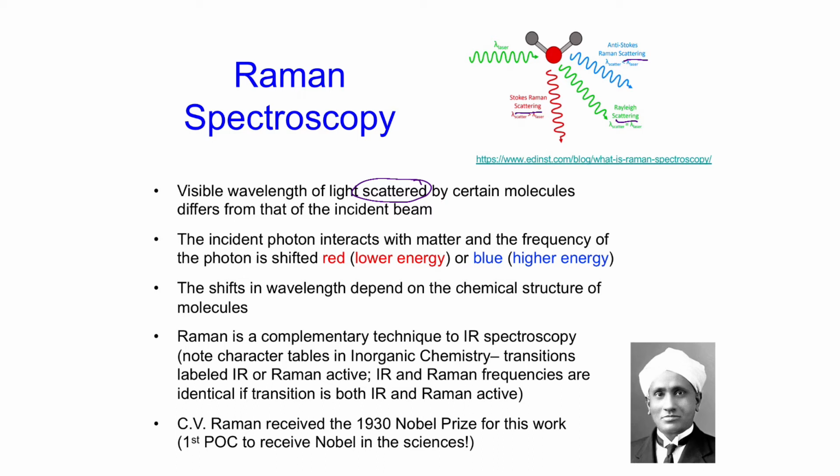Although we are still examining molecular vibrations with this type of spectroscopy, we do consider it to be a complementary technique to IR, so it's not a replacement to IR spectroscopy at all. We use them both to obtain a full collection of information about our molecules.